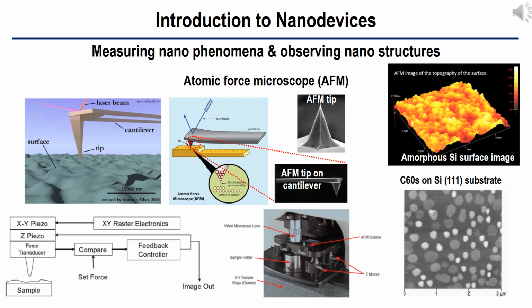In this mode, the tip on a cantilever is in contact with the surface with a given deflection of delta Z sub 0, which corresponds to a force F sub 0. The sample is placed on top of a scanner that can move in XYZ. During XY scanning of the sample, when the tip scans a bump of height delta Z on the surface, the force exerted on the tip is F equals F sub 0 plus K times delta Z.